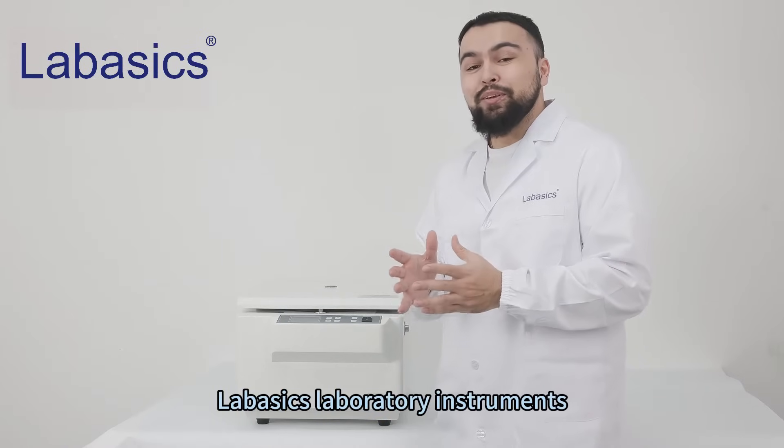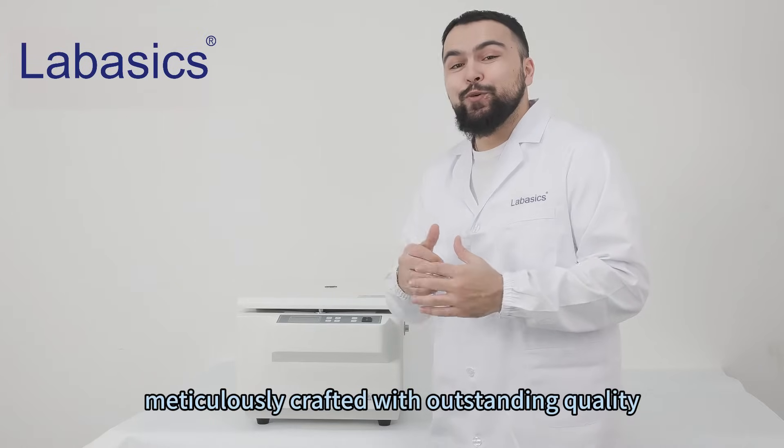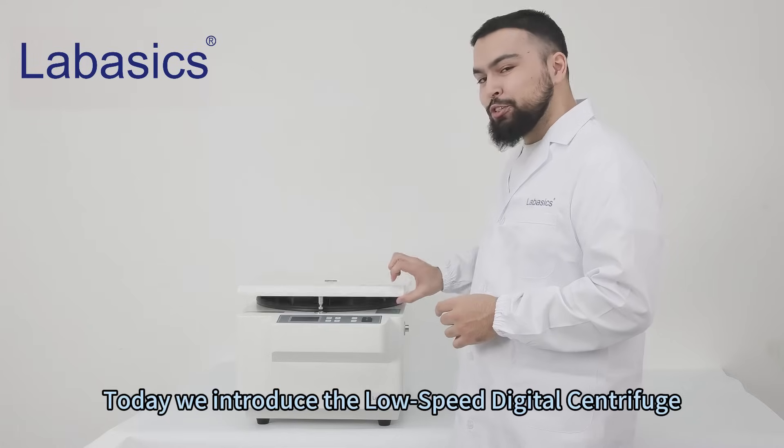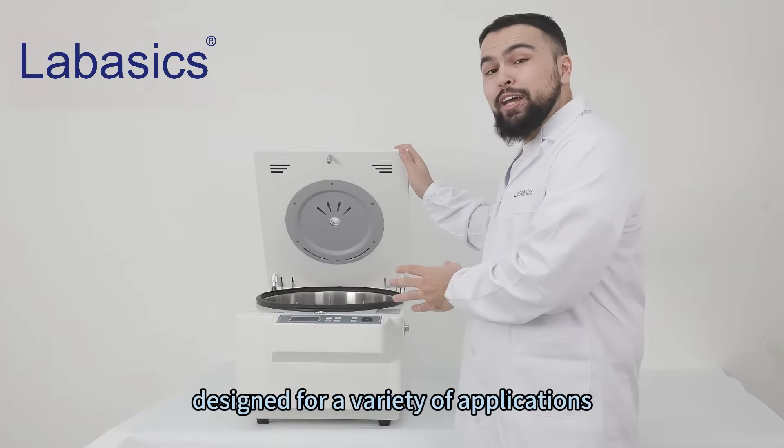LaBasix Laboratory Instruments, meticulously crafted with outstanding quality. Today we introduce the Low-Speed Digital Centrifuge, designed for a variety of applications.